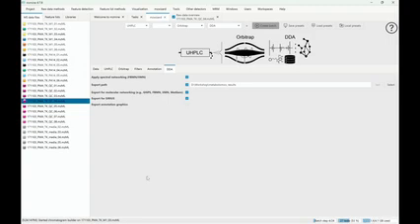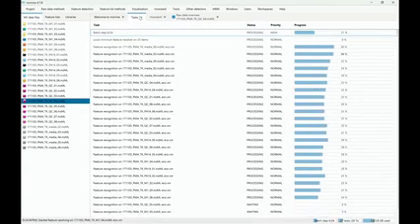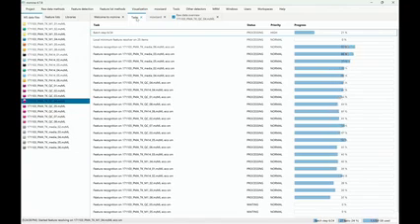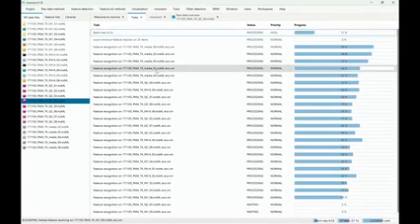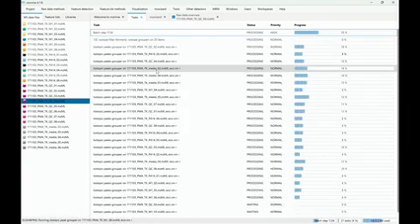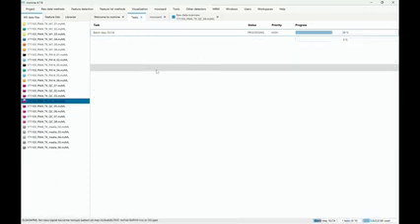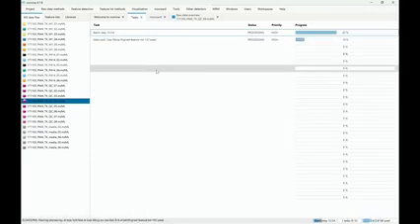And especially the chromatography, if you do a 10-minute gradient or a 30-minute gradient, you definitely need to change the full width half maximum of your chromatography. So in here, we can always click on the task at the bottom, or there's also the task manager, usually open from the start. And you're going to see that mzmine automatically parallelizes all the work. So we have so and so many samples, and they're each being run on a different thread on your computer. So if you have a CPU with a lot of threads, it's going to be faster.